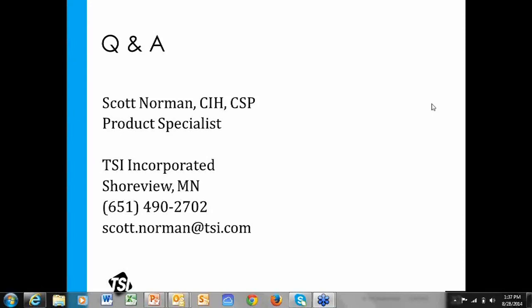There have been a lot of studies done, a lot of aerosol studies you see. People have used our equipment over the years, so there are some things you can find. We do have an app note that summarizes several research papers that have been done in the recent past, which have used DustTraks. So I could refer to that application note on our website.